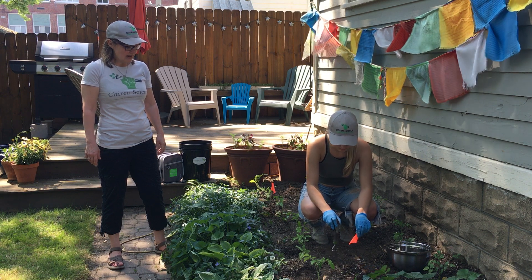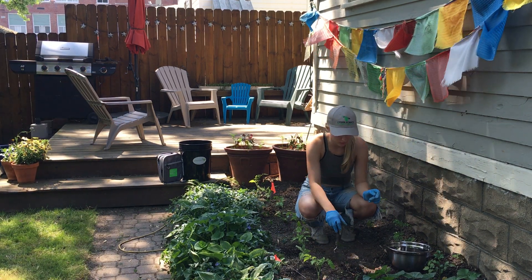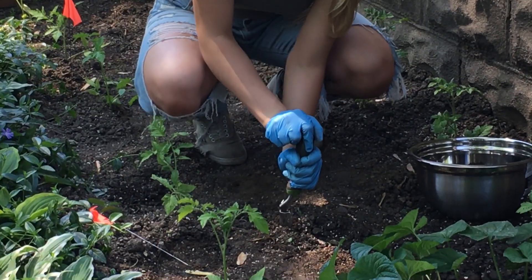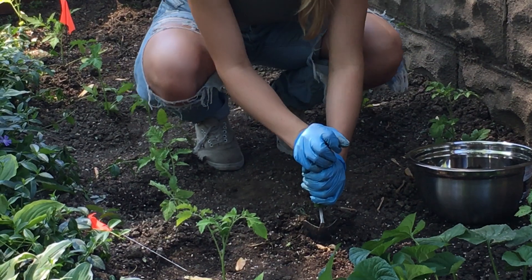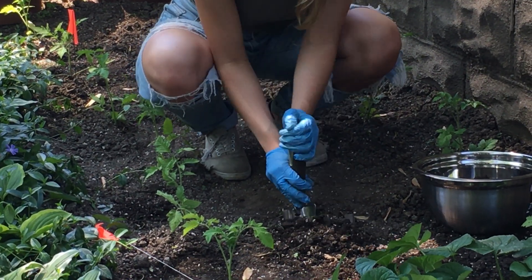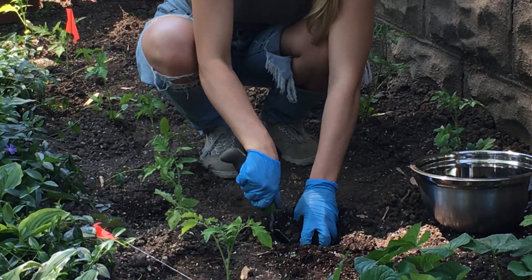Next you will take a sample. You remove the flag and make four incisions in the ground using the trowel you received. It's supposed to be three inches deep for each point. Depending on the soil, it should come out in a cone shape. We already took the first two, so we're just showing you how to do the last one, which you will add into the bowl.